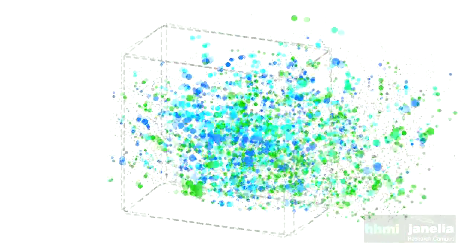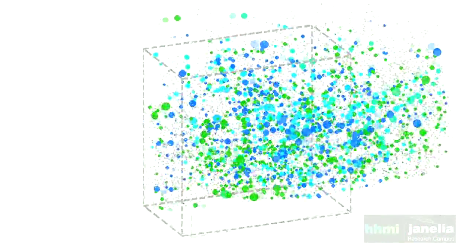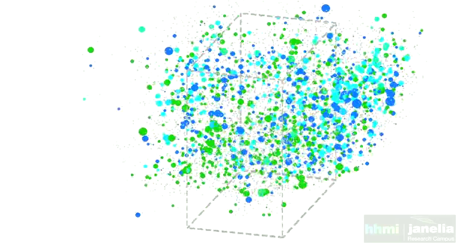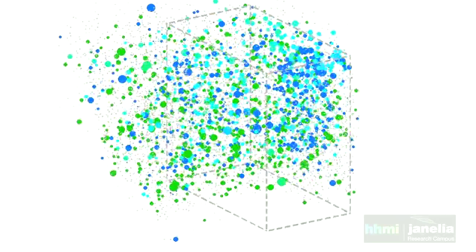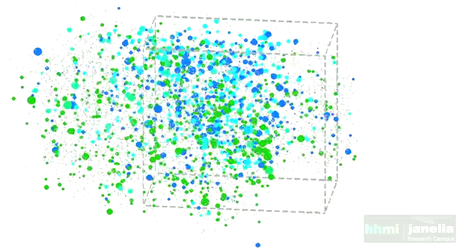The dotted gray line indicates the position of the spared whisker column, that is, the place where input from the one whisker that the mouse has left is arriving at. As you can see, there are far more blue dots inside of this dotted line than outside. This is logical because input from that whisker is of course arriving at that particular column. Green neurons, or whisking neurons, are far more uniformly distributed.